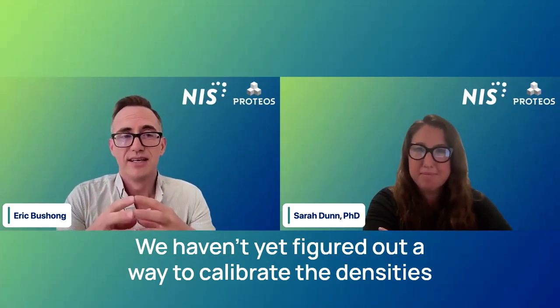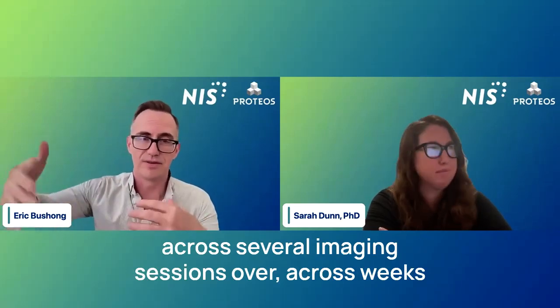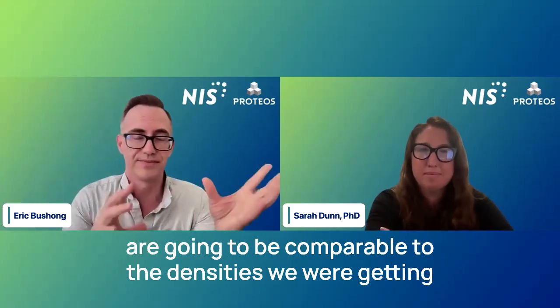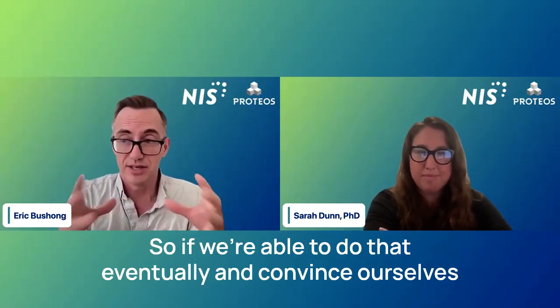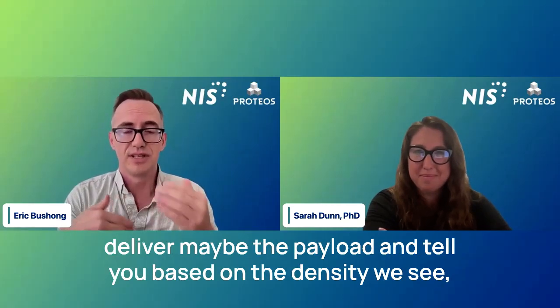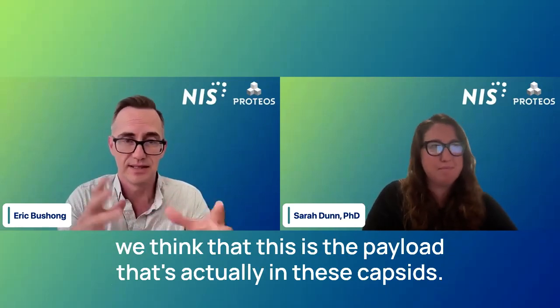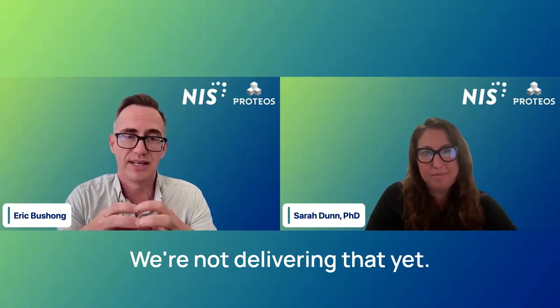We haven't yet figured out a way to calibrate the densities across several imaging sessions across weeks or months or even years, and be confident that the densities we're getting next year are going to be comparable to the densities we were getting on a session today, let's say. If we're able to do that eventually and convince ourselves that we're able to do it accurately, then we could potentially start to deliver maybe the payload and tell you, based on the density we see, we think that this is the payload that's actually in these capsids. We're not delivering that yet.